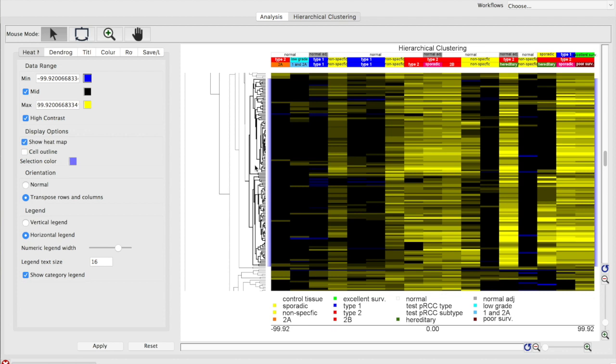The advantage of Correlation Engine is that it takes fold change information. It also considers the ranking of that fold change, so it'll put more emphasis on those genes with higher fold change. And it will actually compare our gene list to all the other gene lists that it has in its database. So we're actually pulling biology from actual studies that are done rather than the text mining that a lot of the other programs do.